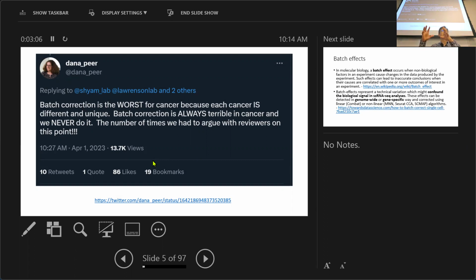I just do cell type identification individually. Then they merge by the same cell type, but they're still in different conditions, unless you believe there should be batch effects. What I tell you is what I did before: I just convinced myself there's no technical batch effect at all.